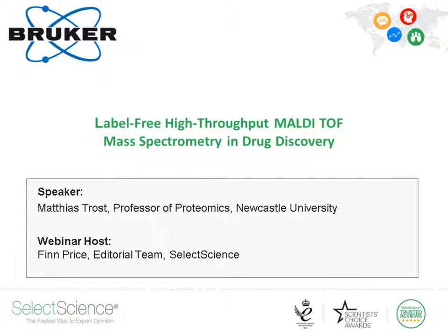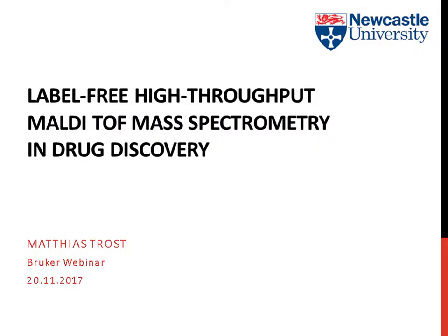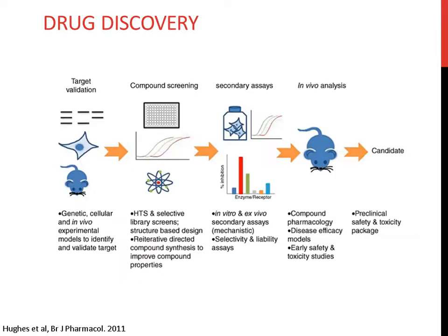Well, hello everyone. Thanks very much for joining me today for our talk, Label-Free High-Throughput MALDI TOF Mass Spectrometry in Drug Discovery. So my lab is a mass spectrometry lab, and we're interested in ubiquitylation, drug discovery, and mass spectrometry. And in recent years, we have moved quite a bit in combining these together.